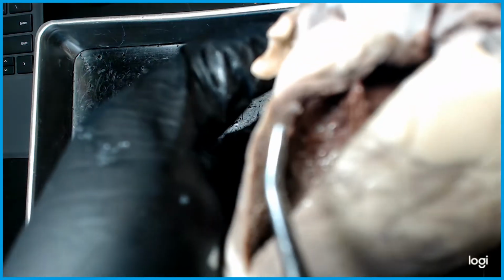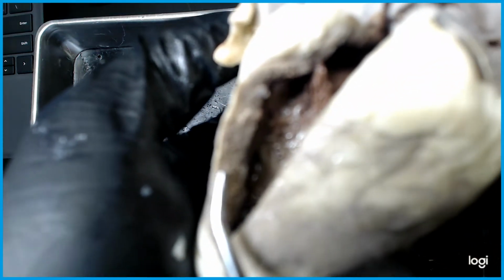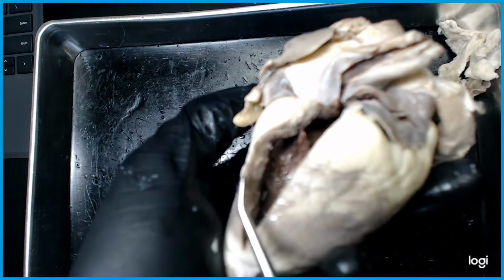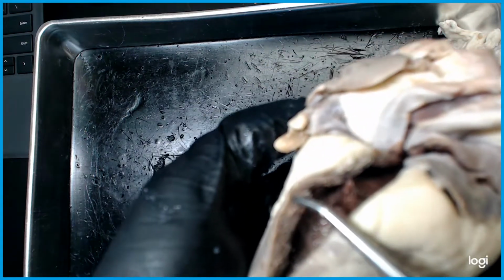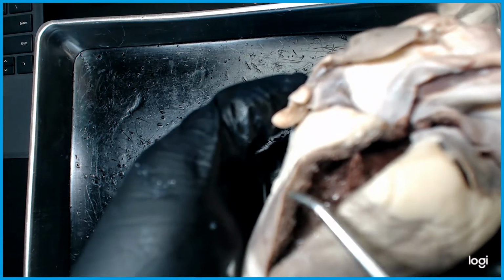Maybe there. See if I can get it to focus through the tip of the probe. But this little edge, the little trim, that should be a good focus. Maybe here. The little itty bitty trim, that's the epicardium.